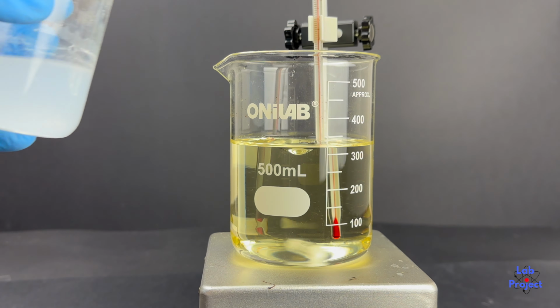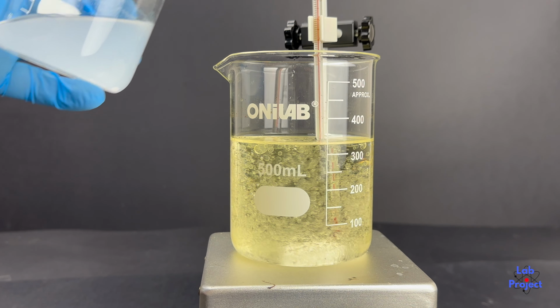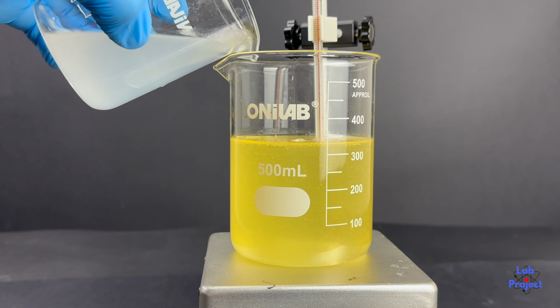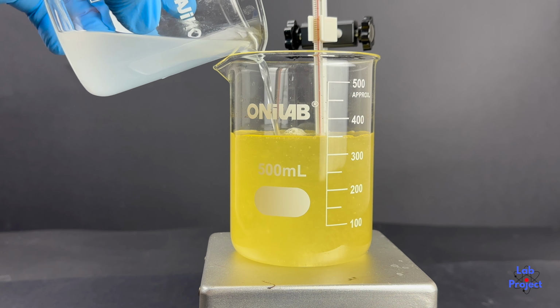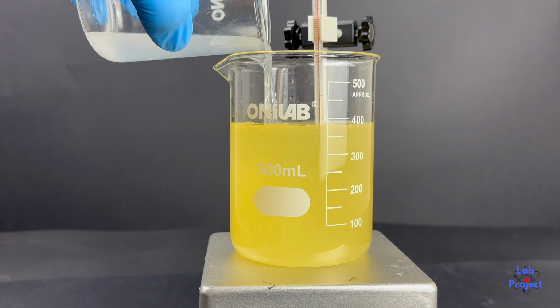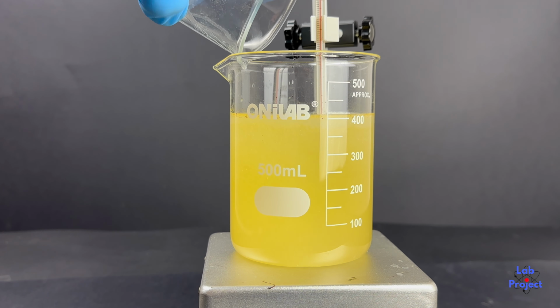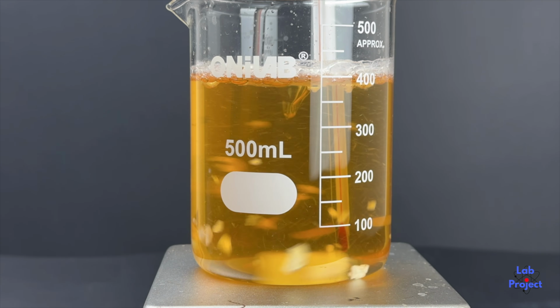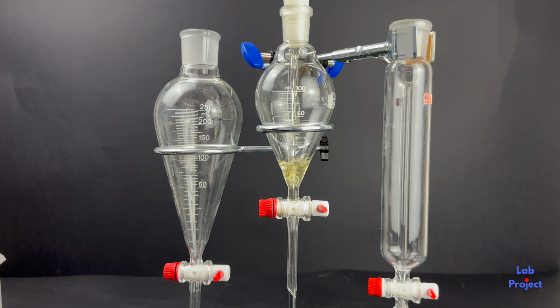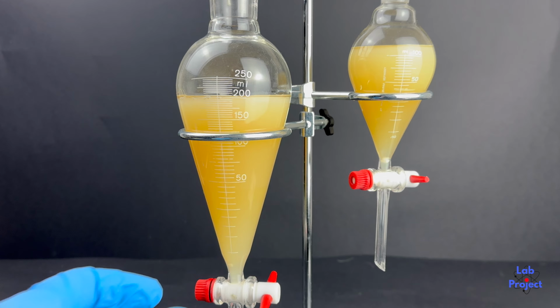When I was eventually done, I slowly poured the methanol with sodium hydroxide into the oil and kept stirring, maintaining a temperature of about 60 degrees Celsius for roughly 2 hours. Then I transferred everything into 2 separatory funnels and left the biodiesel and the glycerin that had formed for about 12 hours. The next morning, I found something strange.